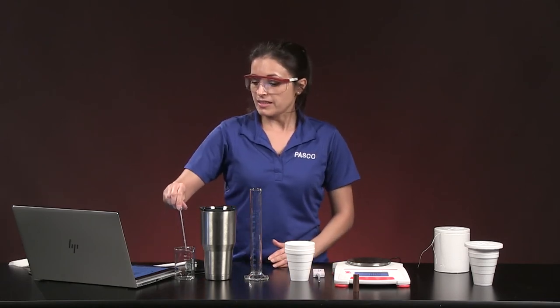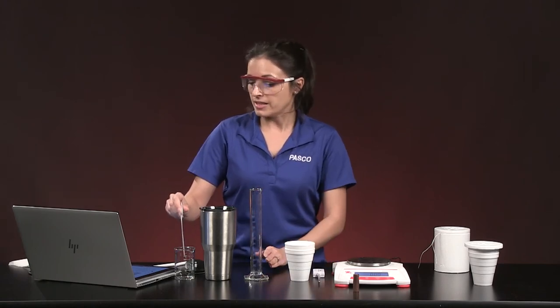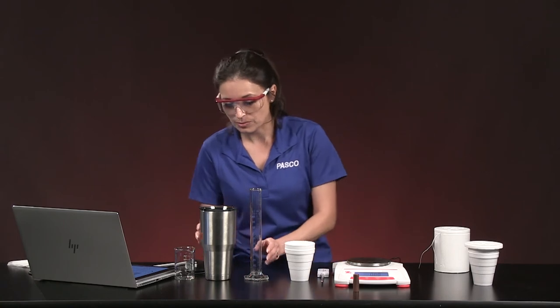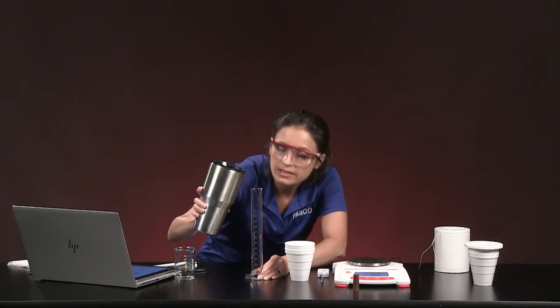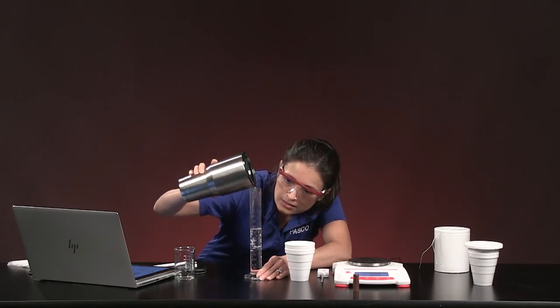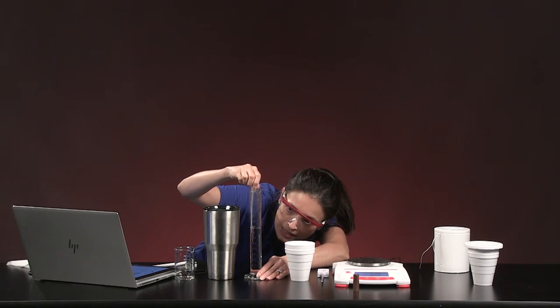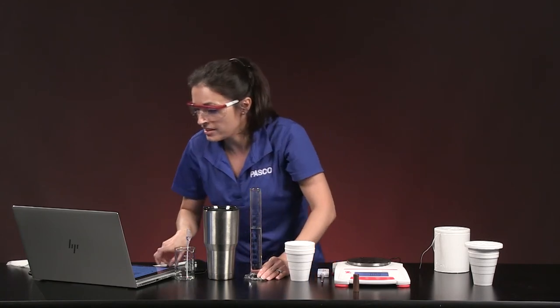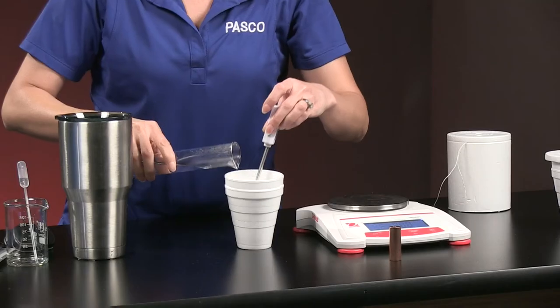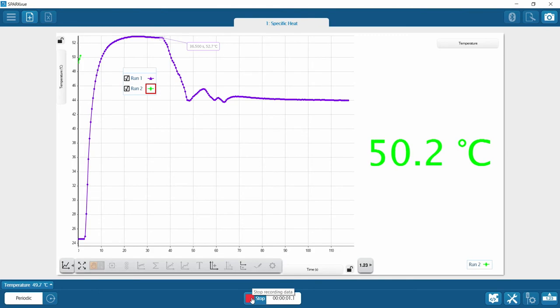The metal is sitting in the ice bath cooling down. We'll assume it reaches zero degrees Celsius — fill that in the table as the initial temperature. We're going to get exactly 80.0 grams of water. I'm emptying the pipette first to make sure only warm water goes into the graduated cylinder, then measuring to reach exactly 80.0 milliliters.